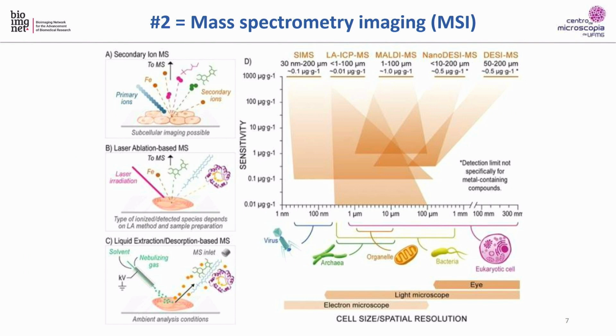The second point, the thing that I've always wanted for years, was some way to do mass spectrometry imaging, MSI. Most of you, I presume, will know most of these. There are a couple of different ways that you ablate. You get ionization, material goes off, and then you measure it. Those different methods of mass spectrometry are now imaging. You can also image a tissue, but it's not very good. The resolution is not good, and you're never quite sure if you're in the right place.